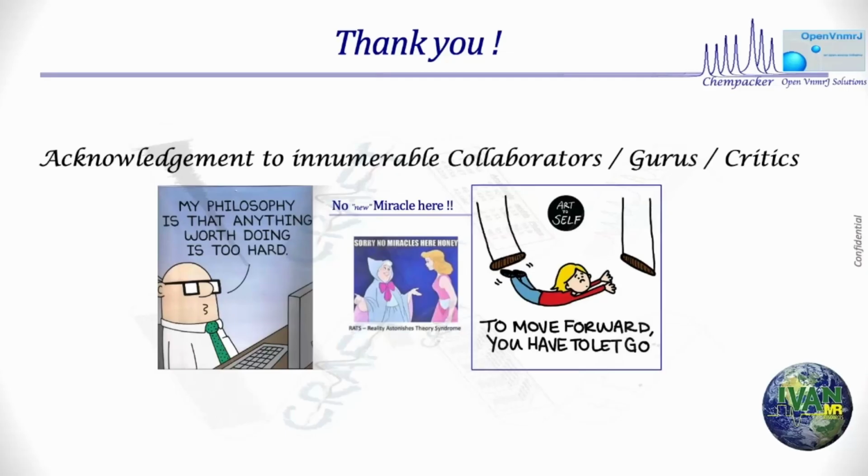In every 2D, what is your cross peak? Let's define cross peak. Within the uncertainty of your measurement, of how you can see that peak, multiplicity or whatever you want to call it, within that uncertainty of that blob, it is a magnetization that precesses in 2 dimensions at a particular frequency, plus minus whatever error. No more and no less. So cross peaks are nothing but a singular entity within the limits of your detection, your processing, your T1 points, your T2 points. Within that limit, it is a singular vector.